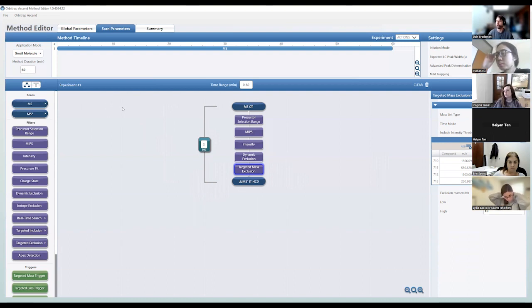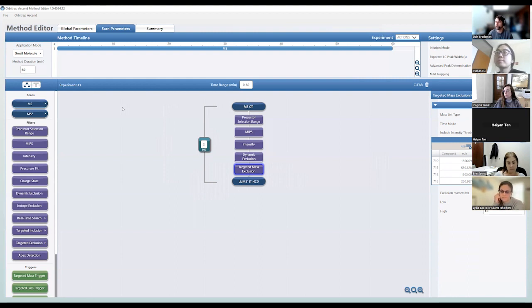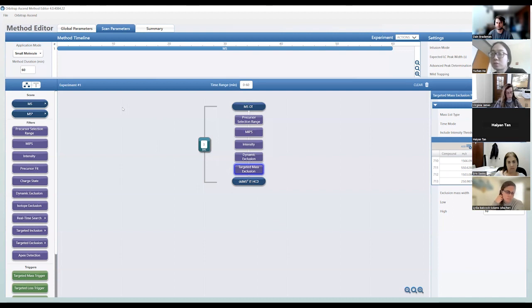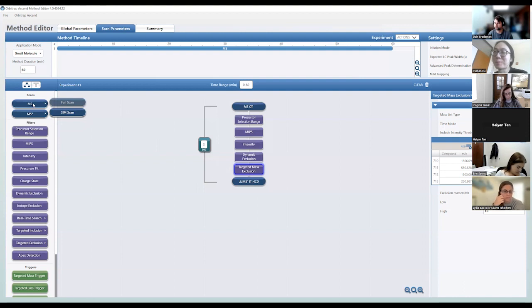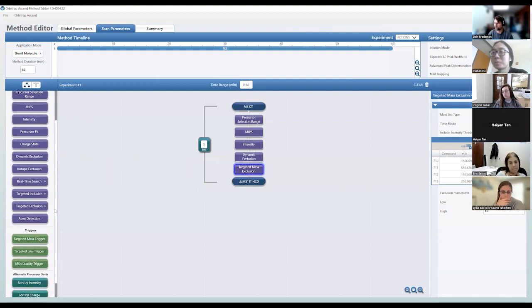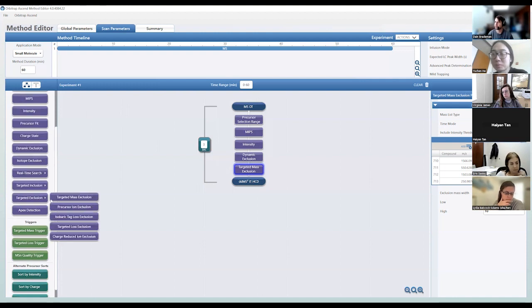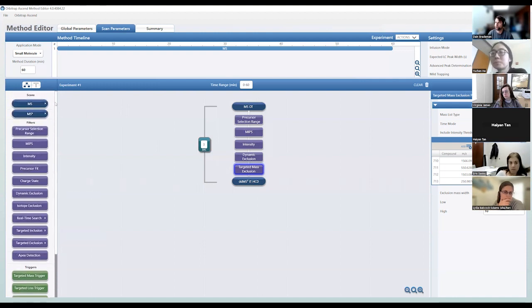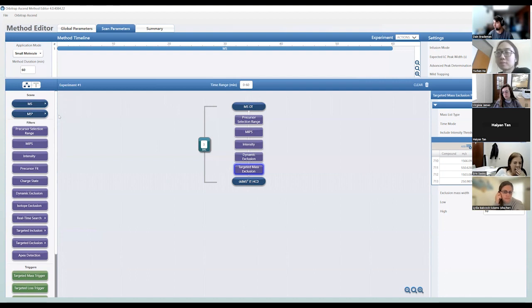That's basically our positive mode DDA analysis. If you want to do negative mode, all you need to change is to go to polarity in your MS1 and change it to negative. On the tribrid I would recommend never running with both polarities simultaneously — if you select both, the ionization polarity will flip-flop so consistently you never have stable spray, and over an hour analysis you collect only about 4,000 spectra, which isn't great.